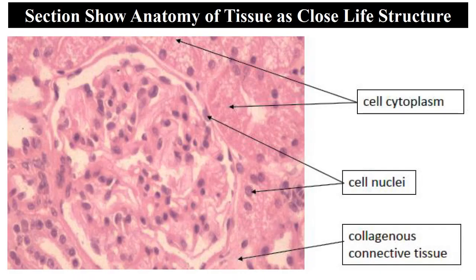Finally, this is the section. It shows the anatomy of the tissue as close as possible to the living structure, including cell cytoplasm, cell nuclei, and collagenous connective tissue.